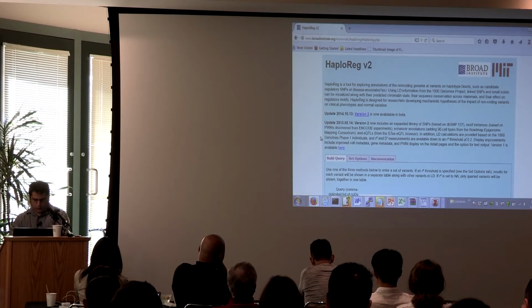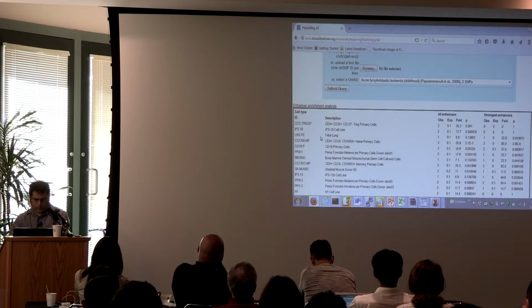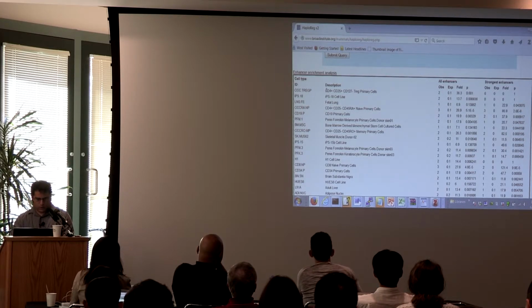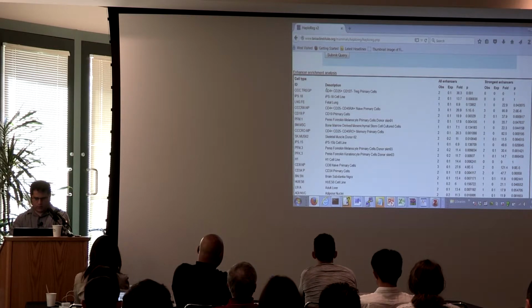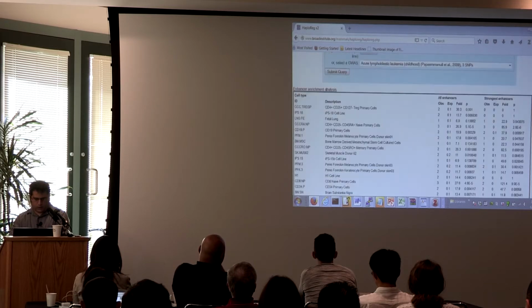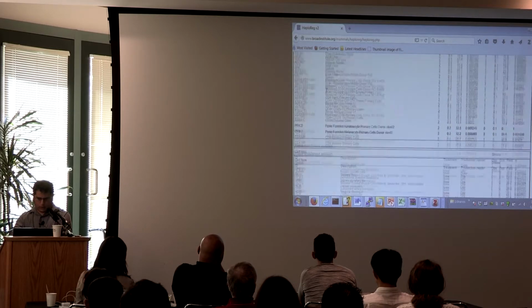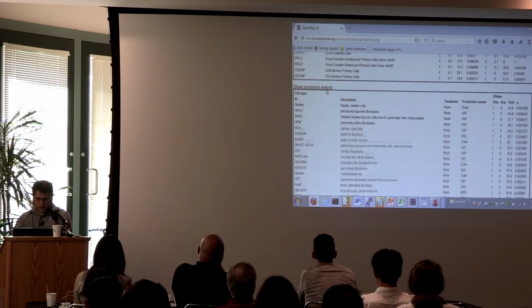And then what it tells me here, it did an enhancer enrichment analysis, and it pulls out CD4-related cells. So this is immune-related cells being enriched here, that 2 of the 3 SNPs were falling into these locations. So it turned out to be significant here, and this makes biological sense.